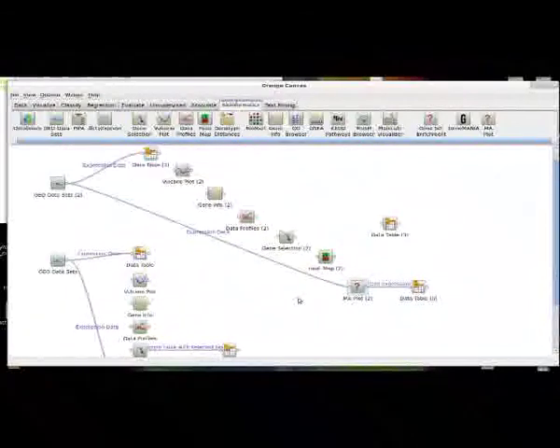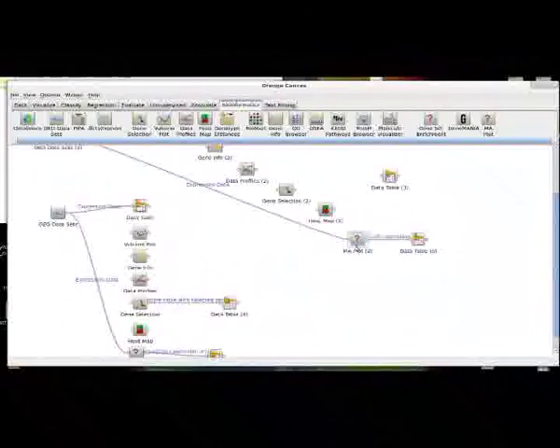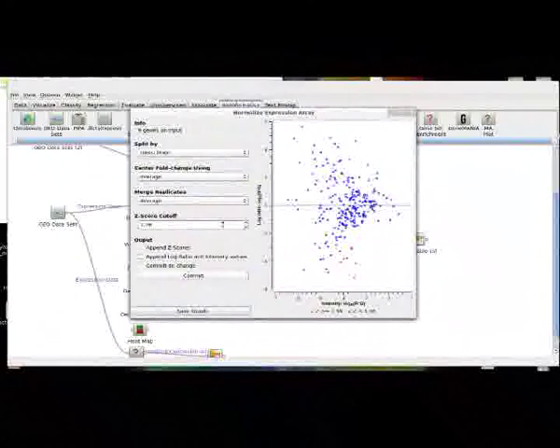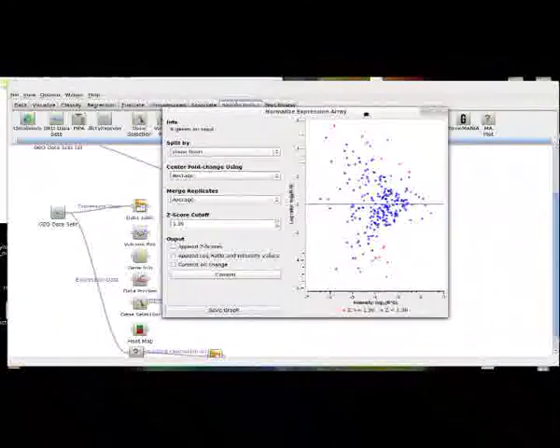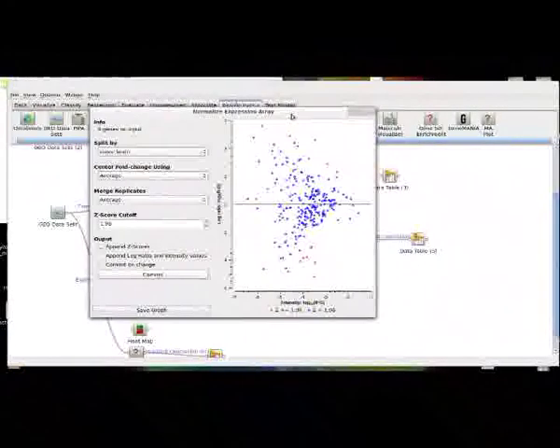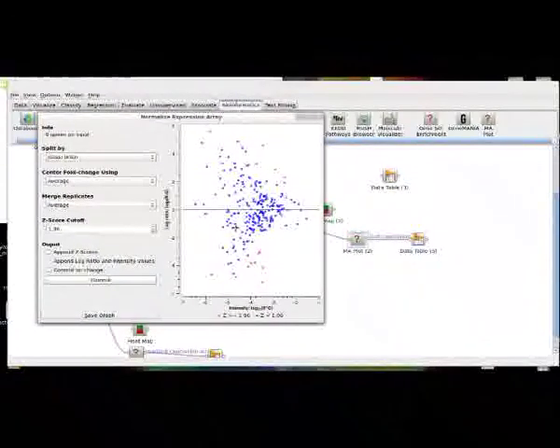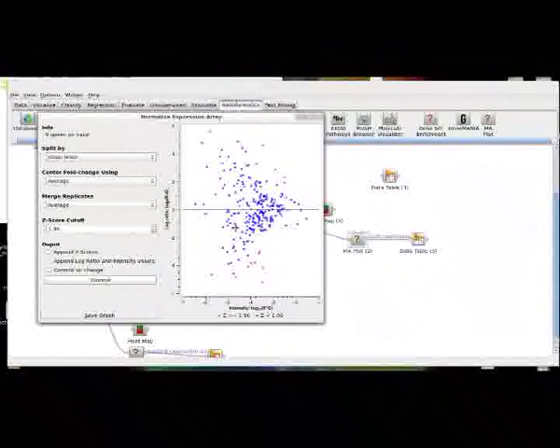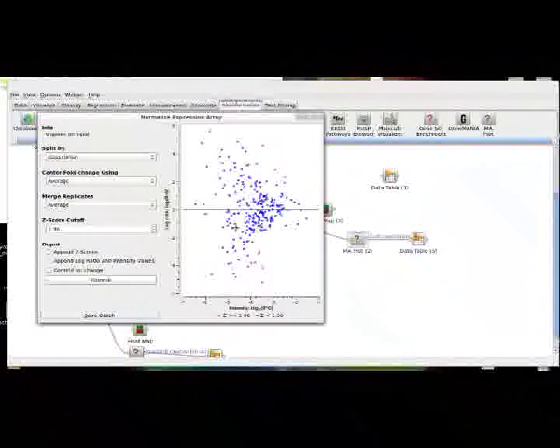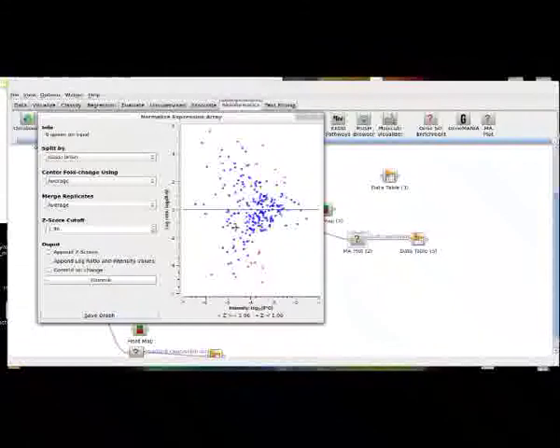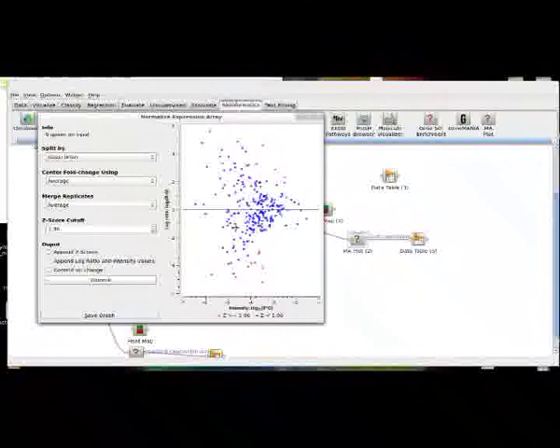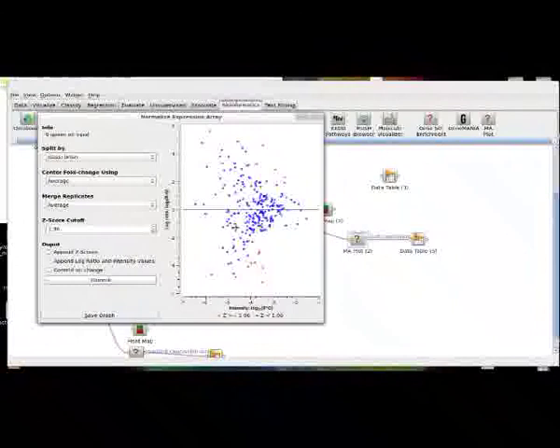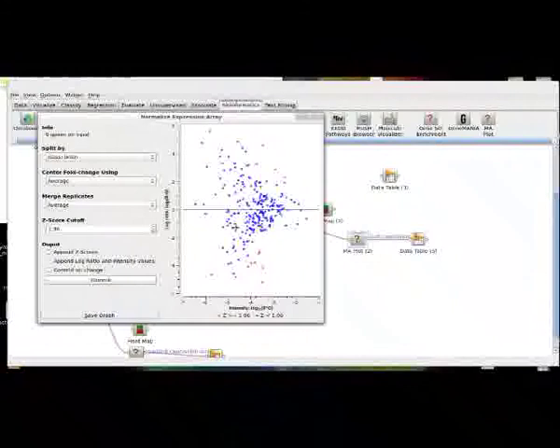So due to the temperamentalness of these orange widgets, I haven't been able to normalize them as I was when I was reviewing for this, but I was using different data sets then, but I guess that just reflects poorly on me. So the idea is, and I wish I could replicate it for you now, is that when you have data that's on a wide range, you want to be able to kind of bring it down so everything's going to be between two kind of discrete points, and you can tell what the expression of one number is relative to the other without having to think about, you know, oh, well, is there anything with an expression score of 100,000, in which case, you know, the difference between something with an expression score of 2 and an expression score of 3, you know, would not be so dissimilar on such a scale.